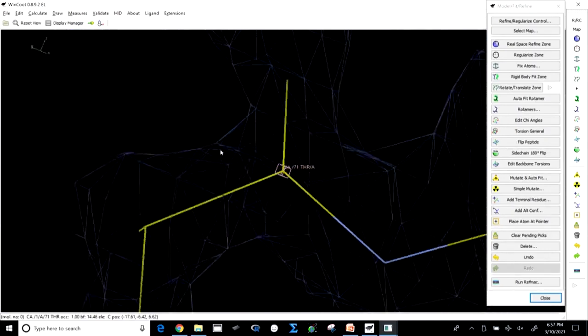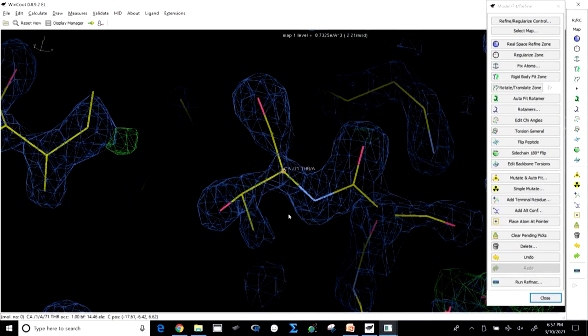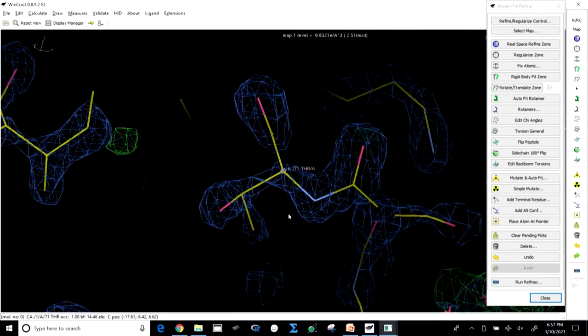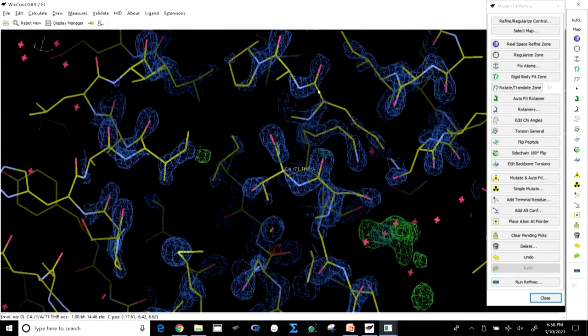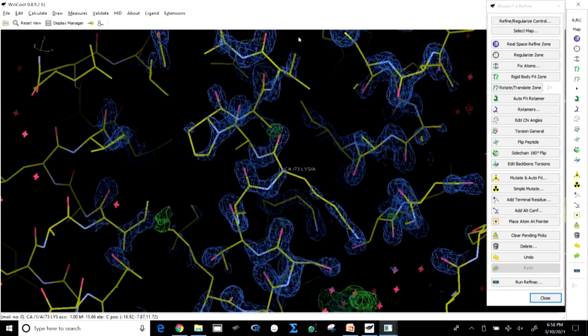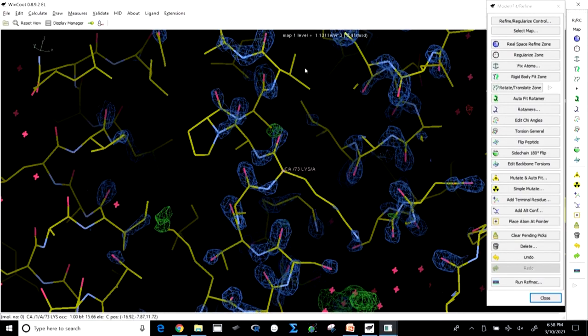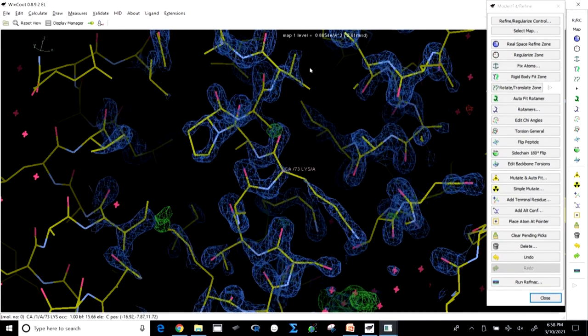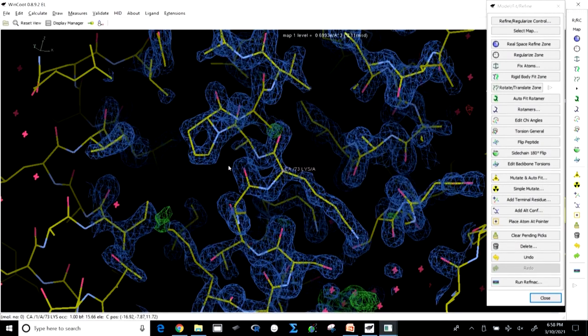As I told, when you start moving your mouse, you will see that the level is getting higher, which you would actually go and see when you are doing that. You see, the map level is increasing, decreasing, it's changing the number. So, you could do them.